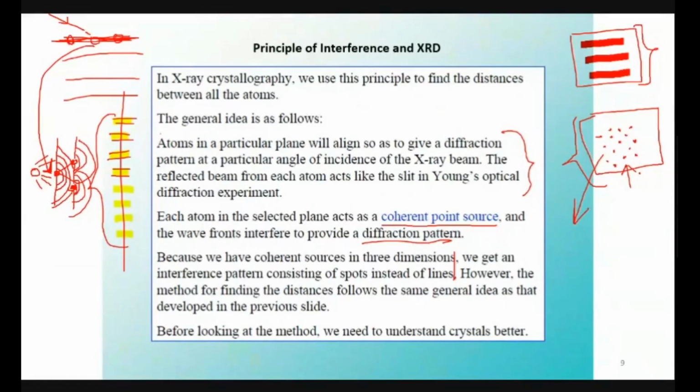That is because there are only a certain number of crystals that are possible. Say there are 20 crystals possible. So for 20 types of crystals, there will be 20 types of crystal patterns. So looking at the crystal pattern, the analyst will understand which formula is to be applied.